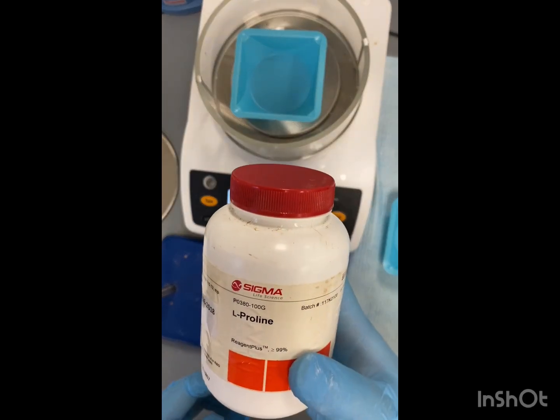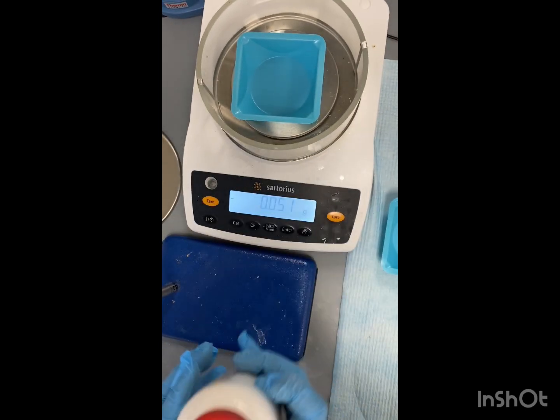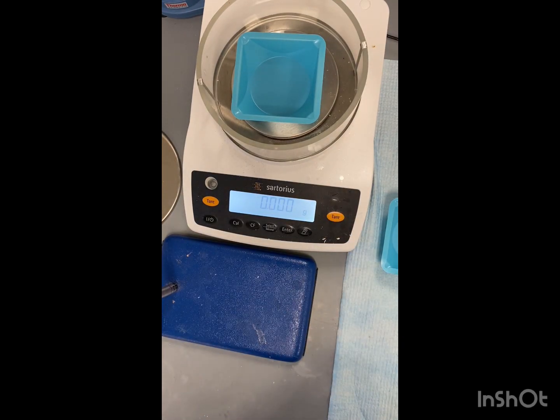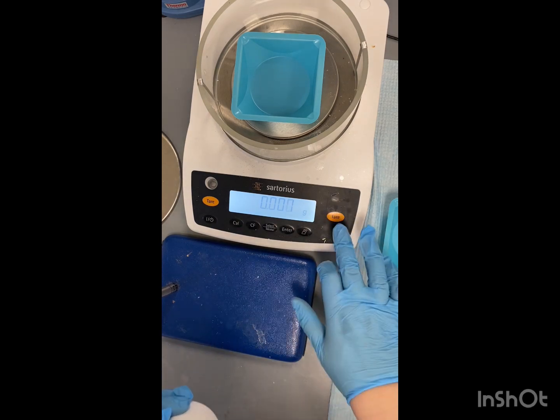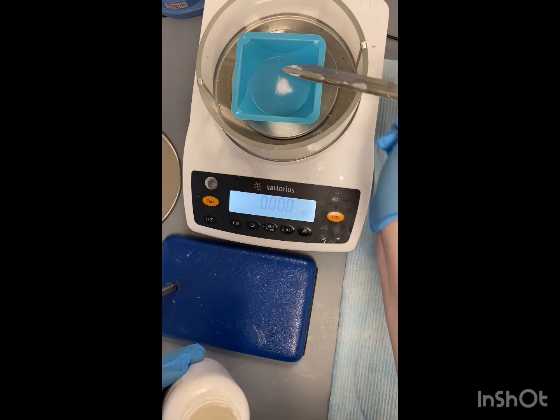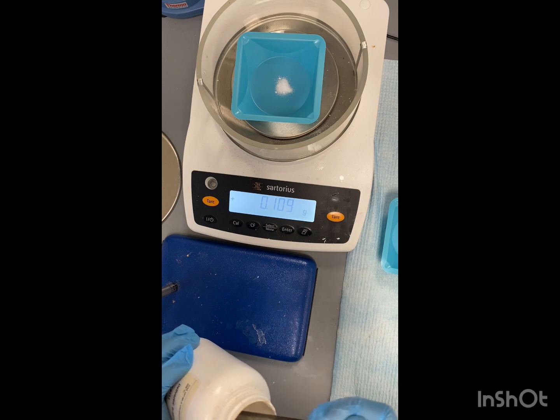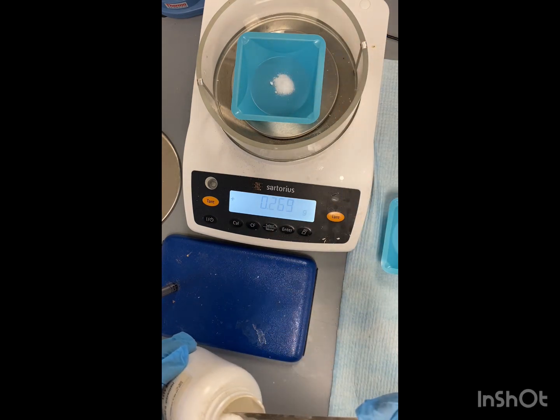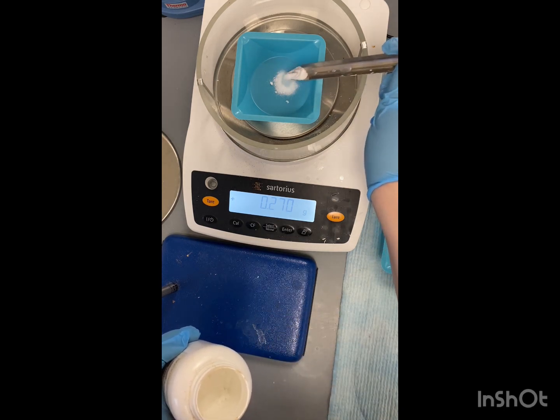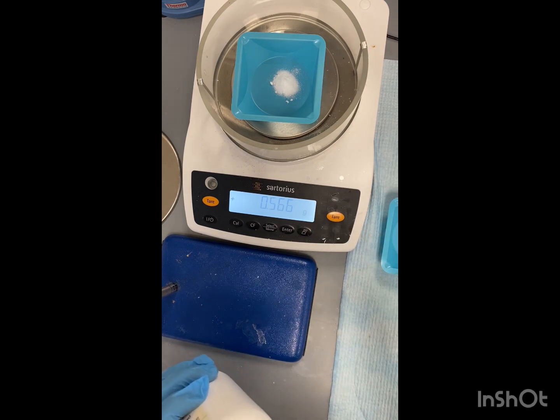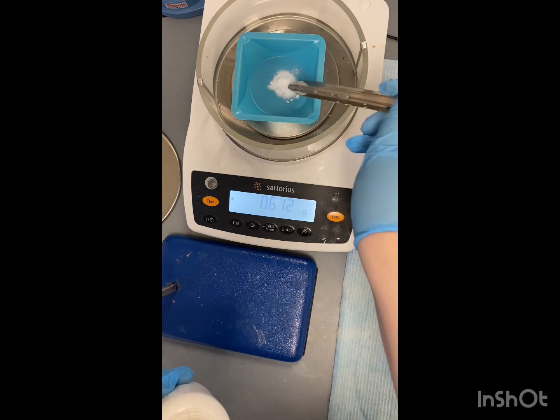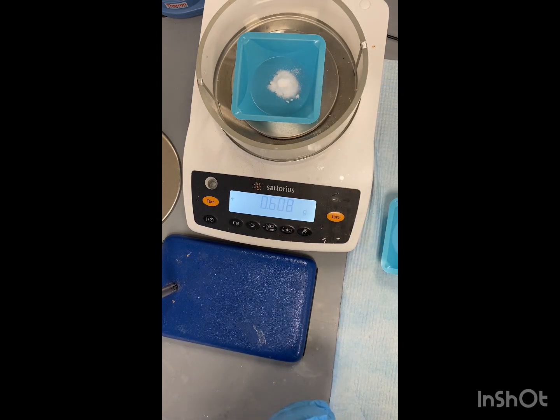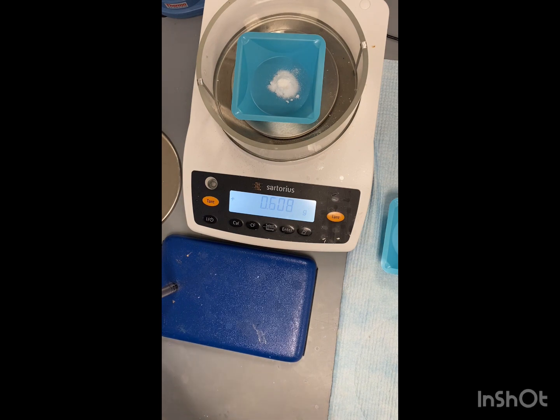Next we're going to add around 600 milligrams or 0.6 grams of our L-proline. Alright, so our final mass on that is 0.608 grams of, again, of our L-proline.